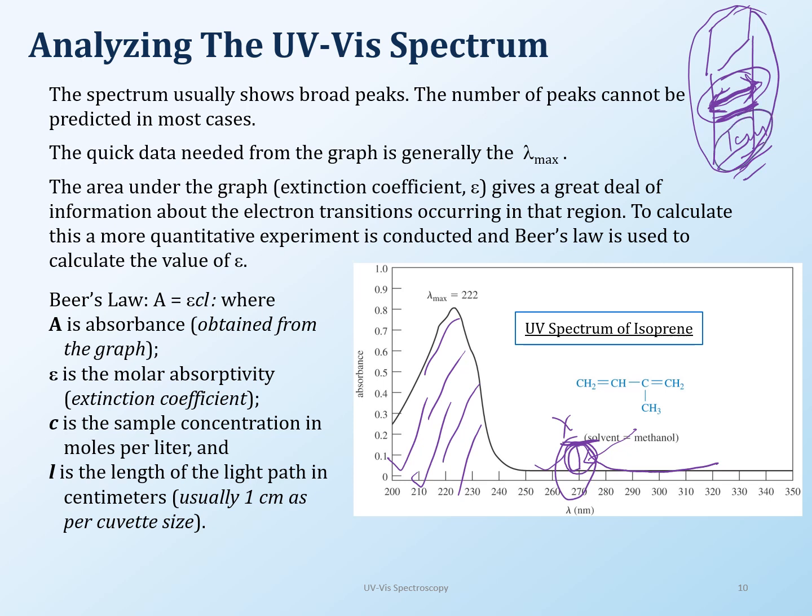If this is one thing you want to completely forget, you're most welcome to, because we're not calculating anything in Beer's law, but I want you to understand that how much light is absorbed changes with how much distance it is traveling within the solvent, or within the solution. So a beach is a good example, okay? So I hope you understand what I'm talking about. So that's why we use the Beer's law here to figure out the area under the graph, okay? Because this tells us the transitions that are happening.